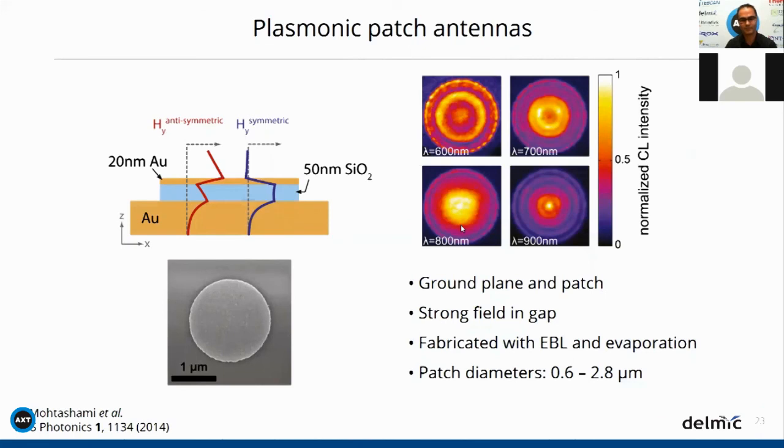And so in the end, you will get a number that specifies the number of photons emitted per electron. But you have to somehow convert that into something that is meaningful, and in most cases, this is not the number you're interested in. But in relative terms, it's very useful, and so in that sense, you can easily compare it.